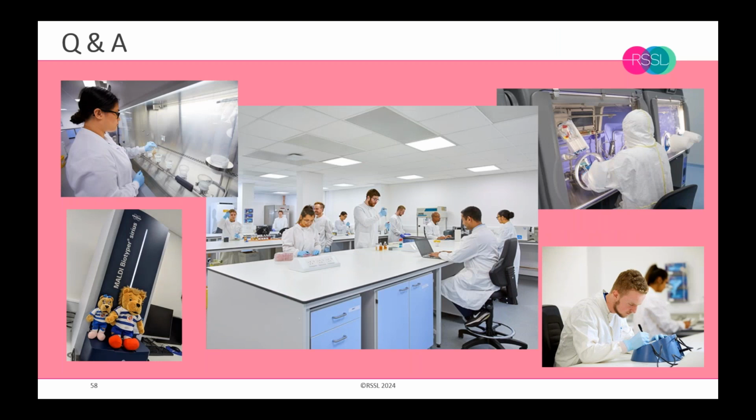So we've had one from Nilesh, and he said, in many industries there's a practice of incubation at 20 to 25 degrees for 3 days, followed by 30 to 35 degrees for 2 days, and they're wondering, is this the correct method?